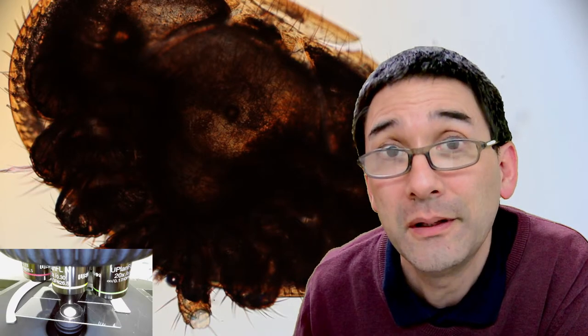Would be a possibility, but if you ever give cell biology lessons, then this can also be a little bit theoretical, right? I have a Swift SW380T microscope. I remember you said in a review video of the microscope that the stage measurements were upside down. I remember this. It's not a big problem.